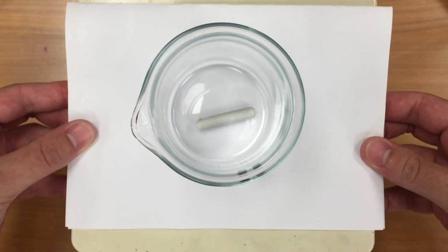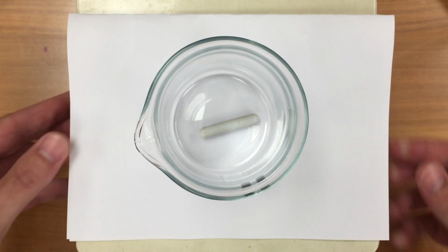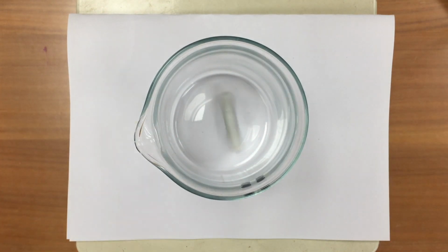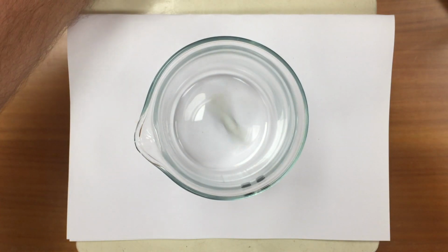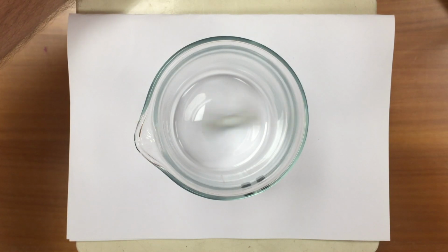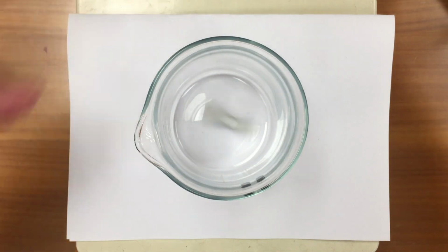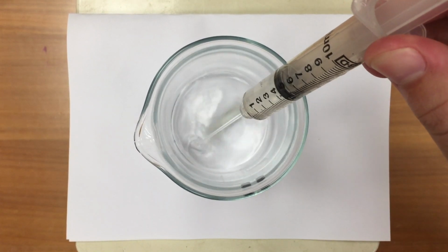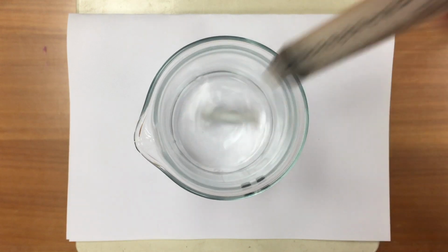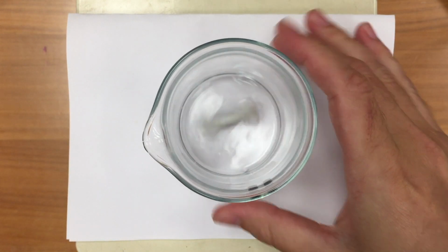So I've got here a beaker with a magnetic stirring flea on a magnetic stirrer. So that will automatically stir for me. So what I'm going to do is I'm going to take 10 mils of hydrochloric acid, just like my scenario required of me. And I'm just doing that by syringe. So there's 10 mils of hydrochloric acid.